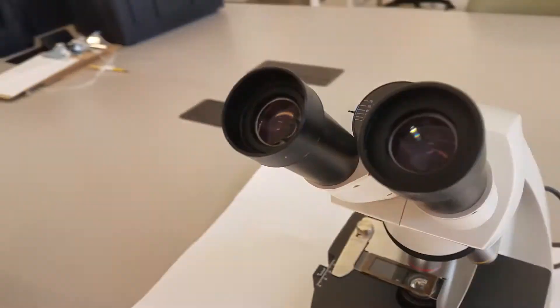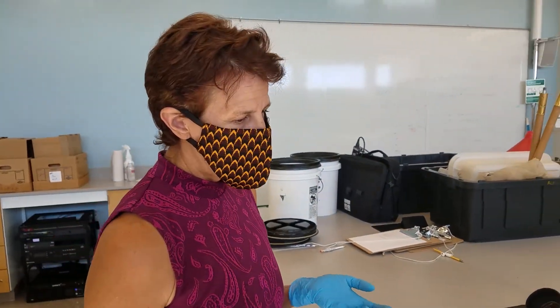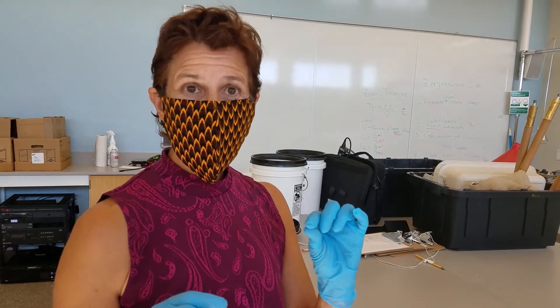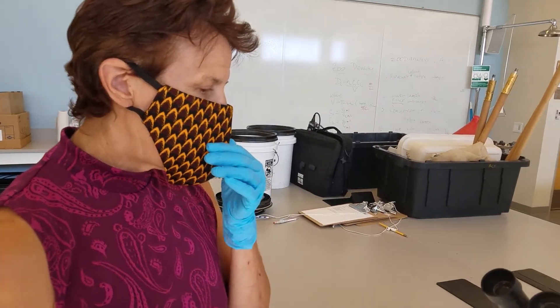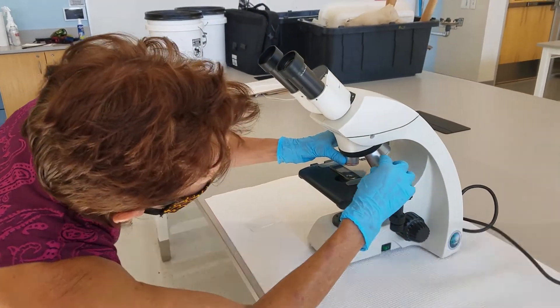The higher magnification oculars have a tendency to get close enough to the slide that, since the slide has depth, they can actually break the cover slip. So you need to be careful of that when you go to the 100X. Now we're going to go to the 100X.